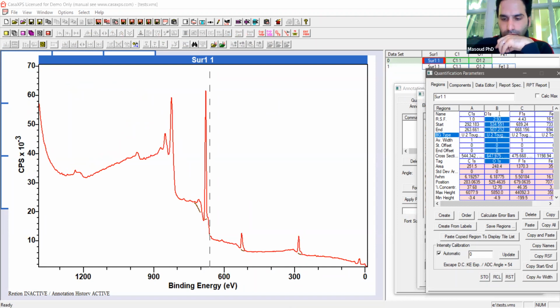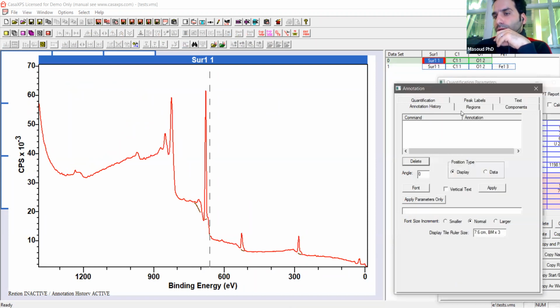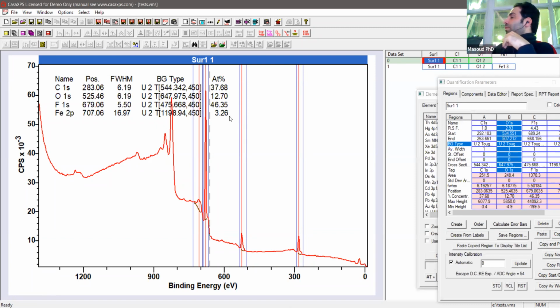So here, let's say that I have made a calculation on the first spot, and I'm doing the annotation, and then I want to propagate my calculation to the next sample.